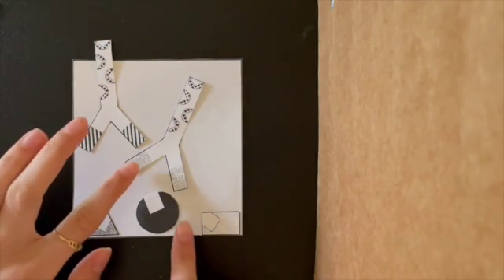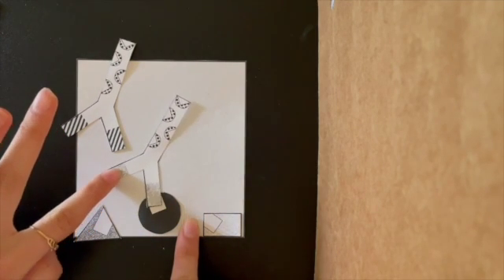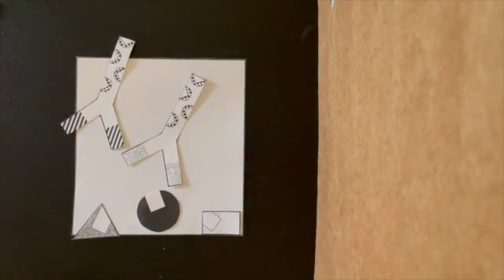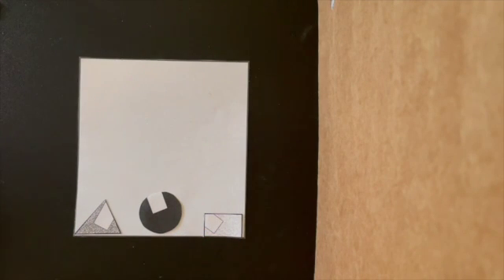In this particular sample, the antibody is not specific for the circular SARS-CoV-2 antigen and cannot bind to the target antigen. Following the same steps of incubation and adding a wash buffer, the unbound primary antibodies will be washed away.